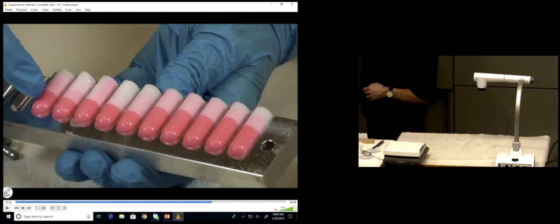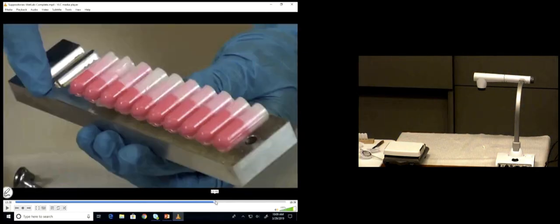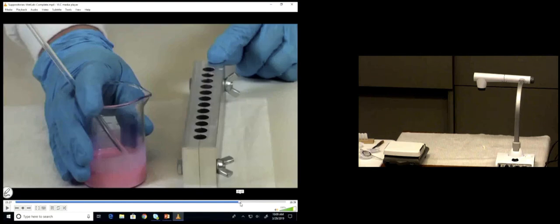So, I don't know where it is in there, but if I stick all 10 of those into a glass beaker, again, a small glass beaker, stick them in the microwave for how long? In your procedure, it says 20 seconds at this point. Melt those for 20 seconds. Boom. Do you see? Then stir them up real good. You see how it's all nice and uniform now? So now you've got a nice even concentration. You can pour that into the molds for your final casting.